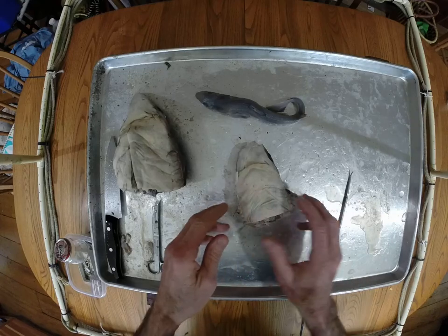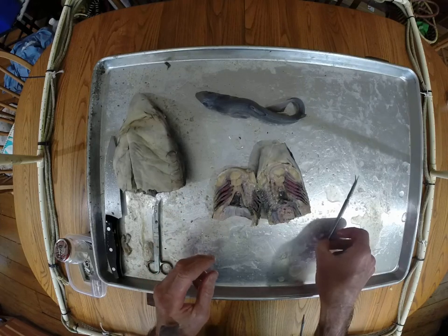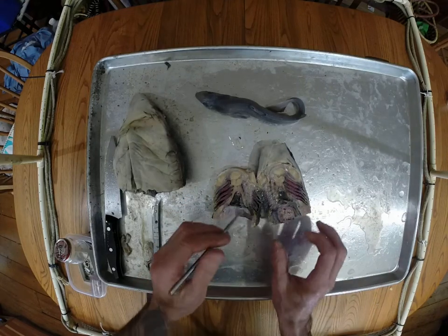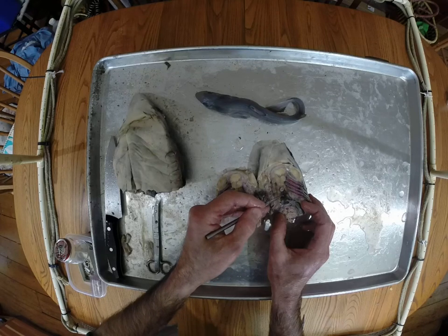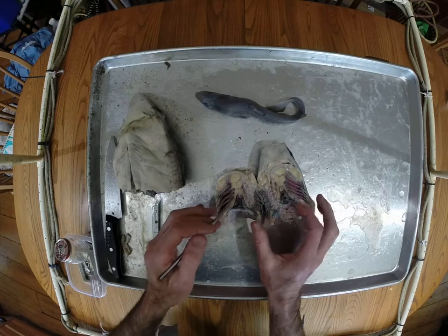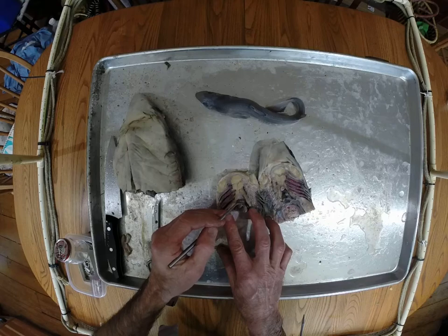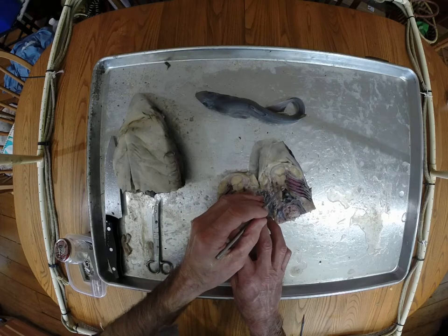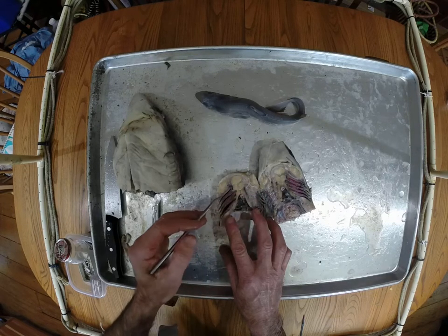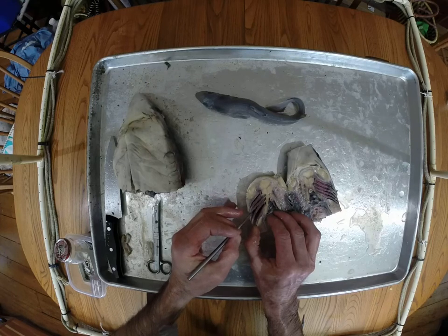Now let's go to this preparation here, where I made a section across the gills so that we can see the structure of the gills. Okay, so if we look right down here, you can see I've sort of cut through the heart. Let's go here. So I've cut through the atrium. The ventricle is right there, part of the conus arteriosus here. The remainder of the conus and the rest of the branchial arteries are in this section. But what I'd like to show is the gills themselves, the gill arches.